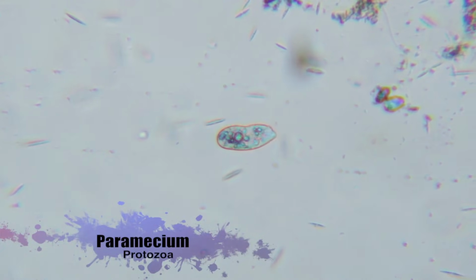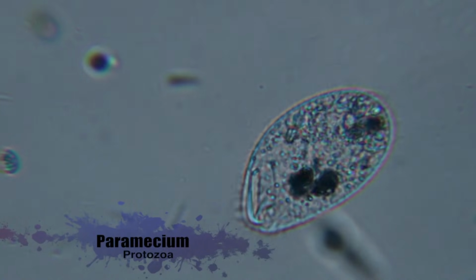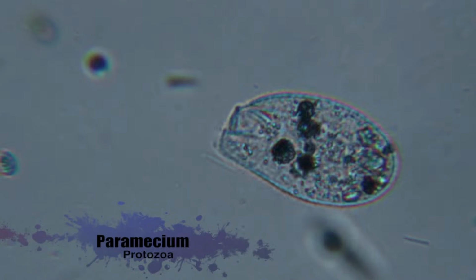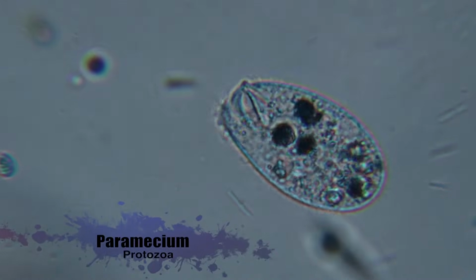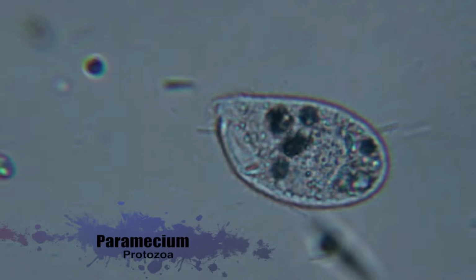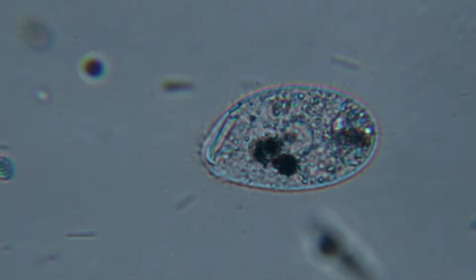One thing I like about using a microscope is that it gives you X-ray vision. This is because the light you're observing is passing through the organism, as opposed to what you would normally see, which is reflected light. Like the tadpole gills, Paramecium is covered in cilia, and it uses these tiny hairs like thousands of tiny oars to propel itself through the water.